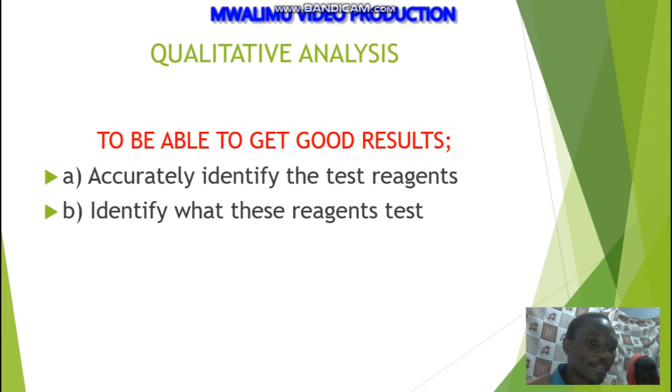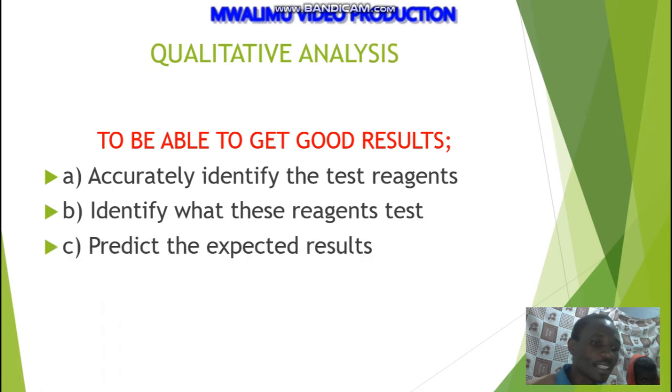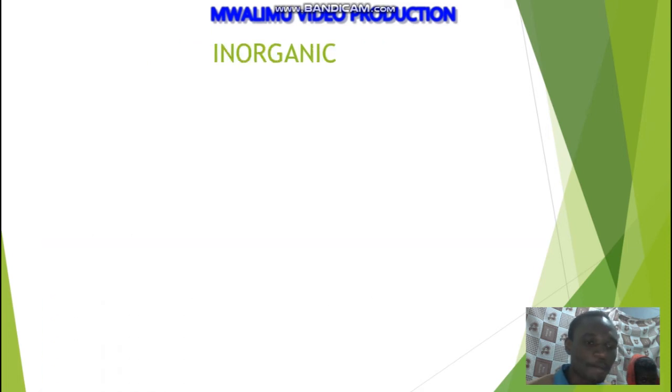Number two, identify what these reagents test. Then number three is to predict the expected results.